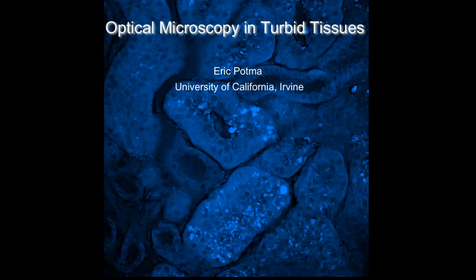We want these kind of snapshots of tissue, high resolution, okay, so sub-micrometer resolution, and some form of contrast that is meaningful. Hopefully, contrast that tells us something about the presence of certain molecules at certain locations. The sub-micrometer resolution is kind of important. It allows us to see individual cells and sometimes even details in cells. So subcellular resolution can be extremely useful for diagnostic purposes.